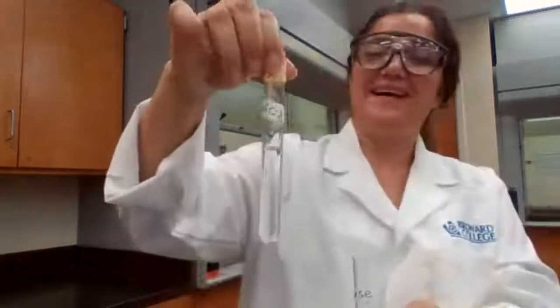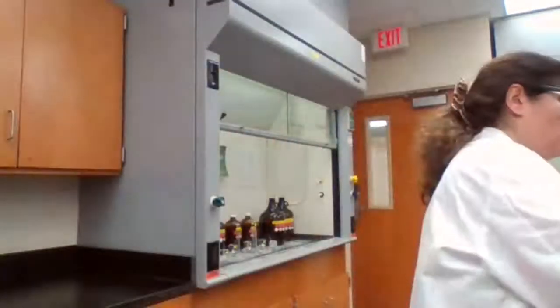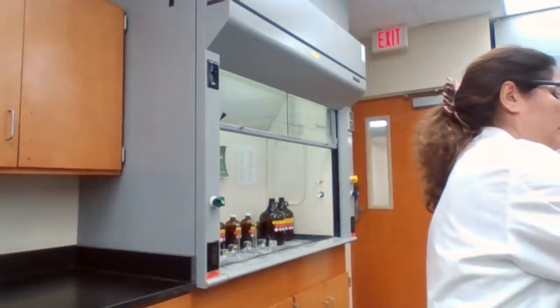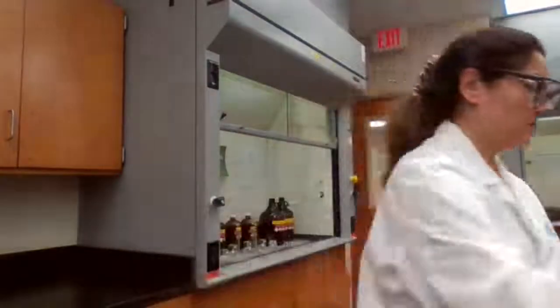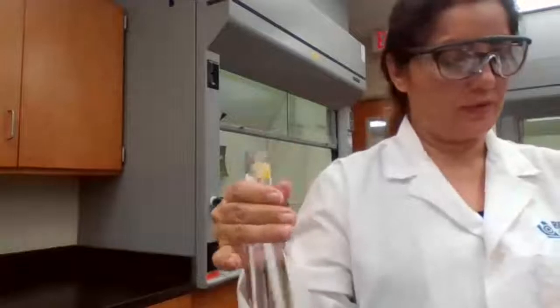I'm a little slow because I'm a little exhausted. Anyway, I have my test tube labeled acid and a test tube labeled base. I'm going to add H2SO4 to the acid and NaOH to the test tube labeled base. Just following the procedure.